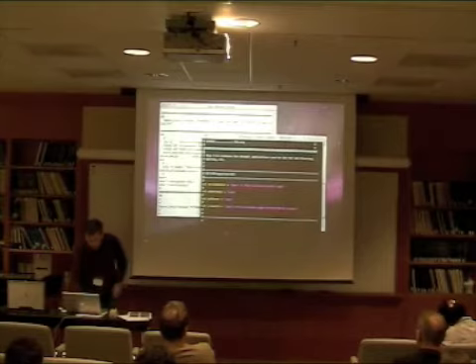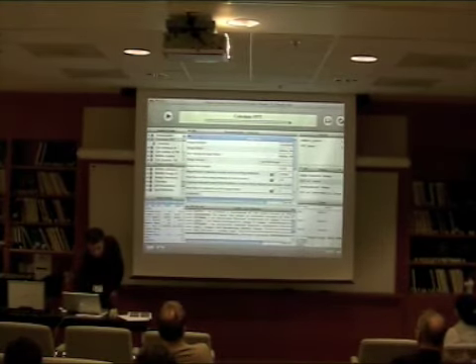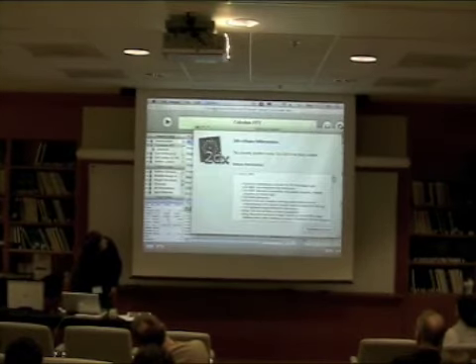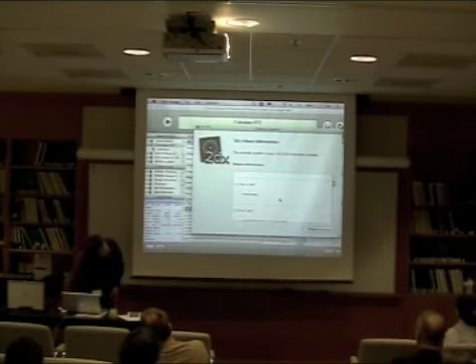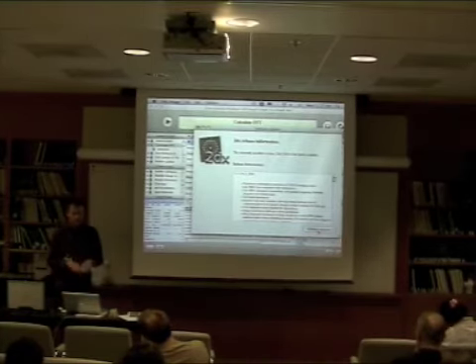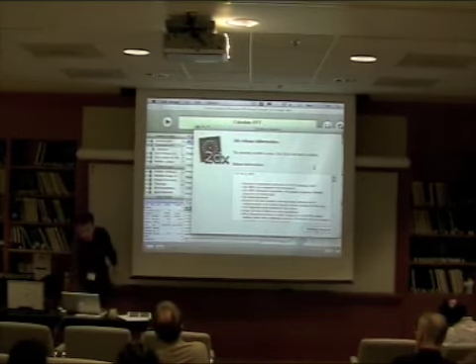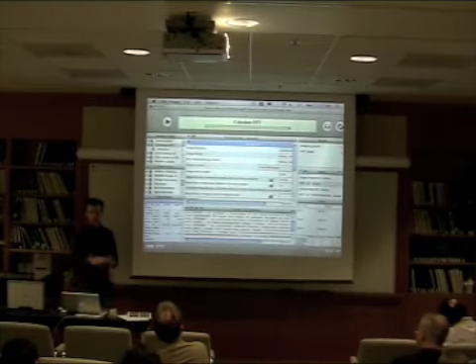Okay, so if you go up to options and update, then you can see what the most current version is. You can see that the one that you've got is the most current version. We've got all the changes and everything. When you click this update button, it's going to actually take you to our web page, and there'll be an installer. Apologies for that. We have actually separated out the scripts and the internal programs in such a way that those can be installed on top of an existing 2DX installation. At least it will be in the next version. Because at this point, the overall layout and everything doesn't really change from version to version, and there's no real reason for you to have to re-download that and so on. So, almost. Ease of upgrade is still an issue.